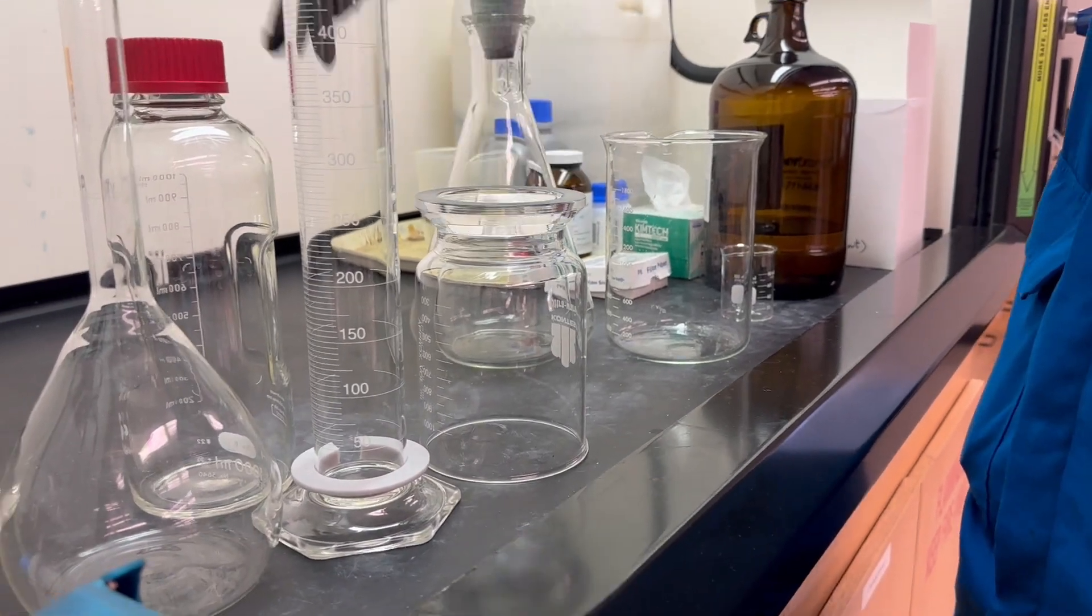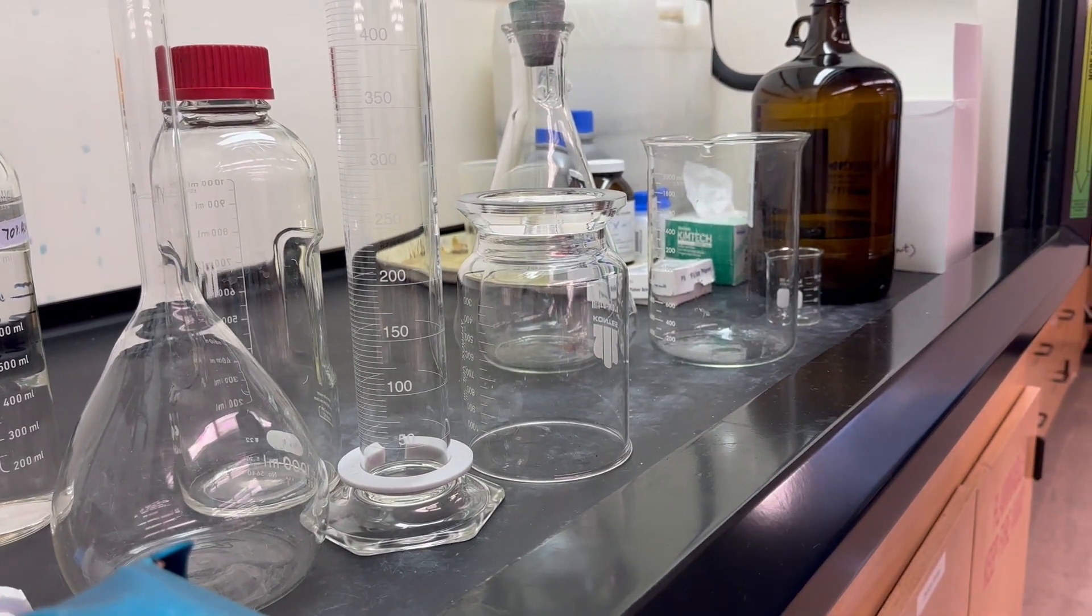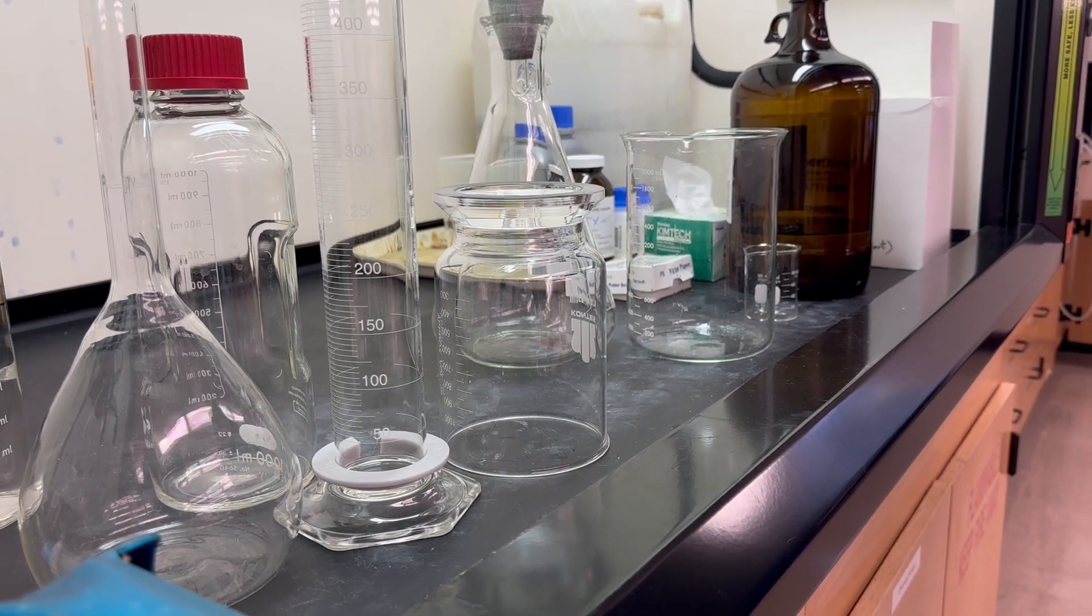That vacuum filter solution will then go in the mobile phase bottle, and we'll need it stirring at 800 rpm for at least 20 minutes.